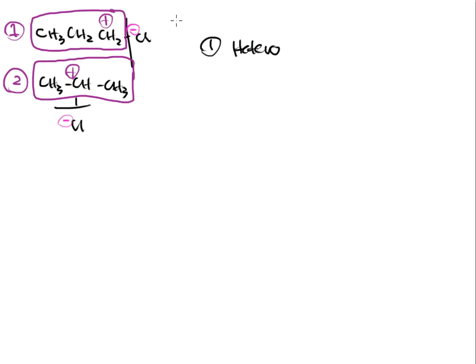That means that the weight of the fragment here would be 12, 12, and 12, 36, 37, 38, 39, 40, 41, 42, and 43. Well, if we do the weight of that fragment, 12, 12, 12, 36, 37, 38, 39, 40, 41, 42, 43, it gives me the same fragment weight. That's not really going to help us to determine it, is it?